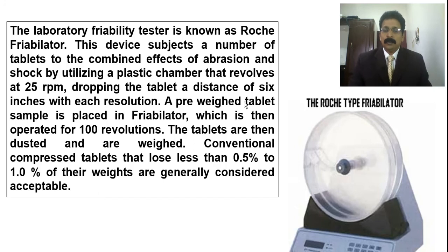So now the next step of evaluation of tablets, finished tablets, and also in process tablet evaluation, Friability Tester. So we want to discuss about what is friability and how the friability is tested.